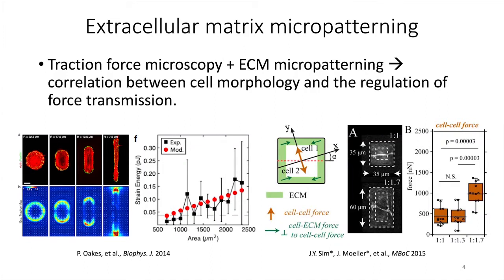The adjacent graph shows another interesting finding from this paper. The strain energy of single cells spread on micropatterns of different areas scales with the size of the cell, independent of the number of focal adhesions.